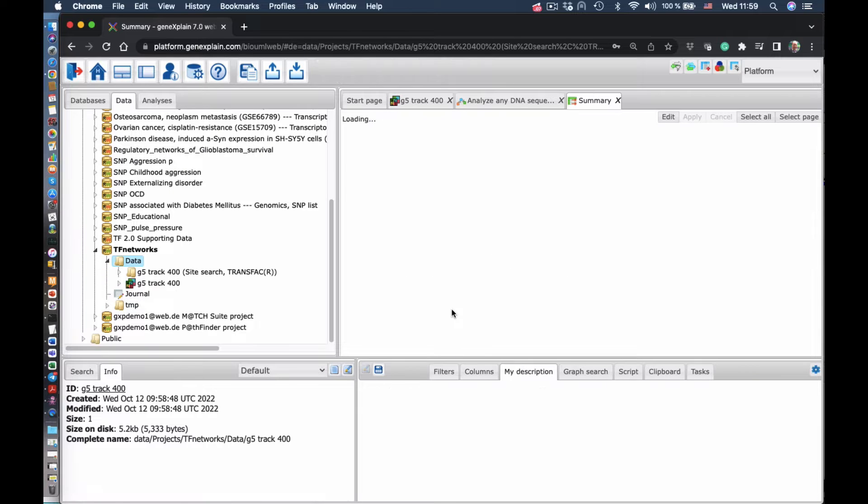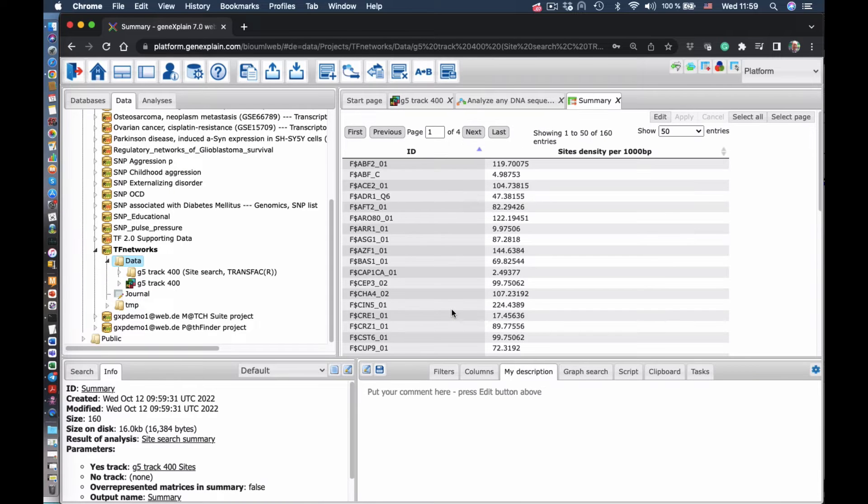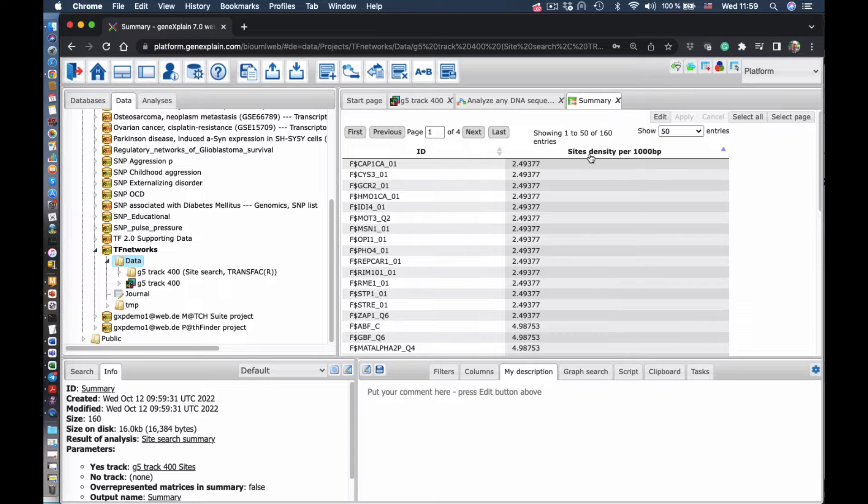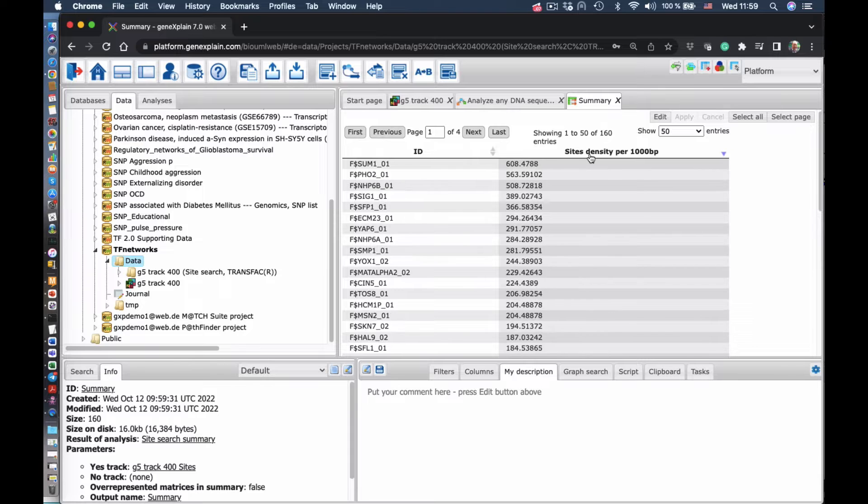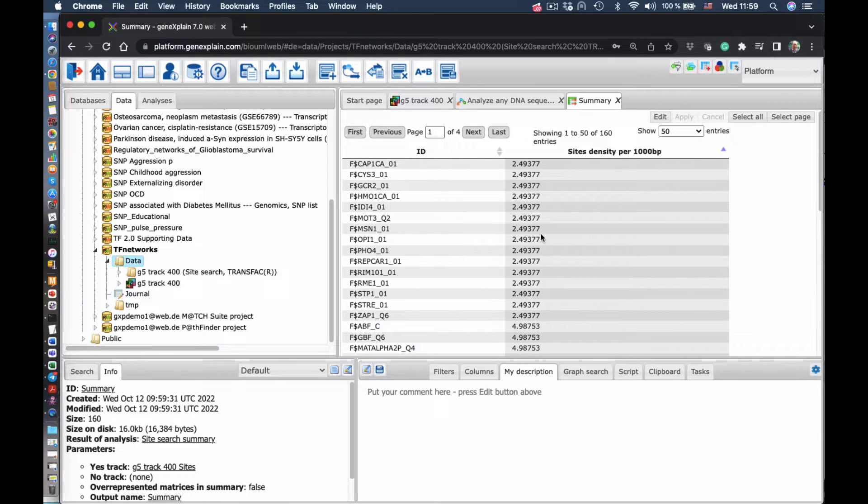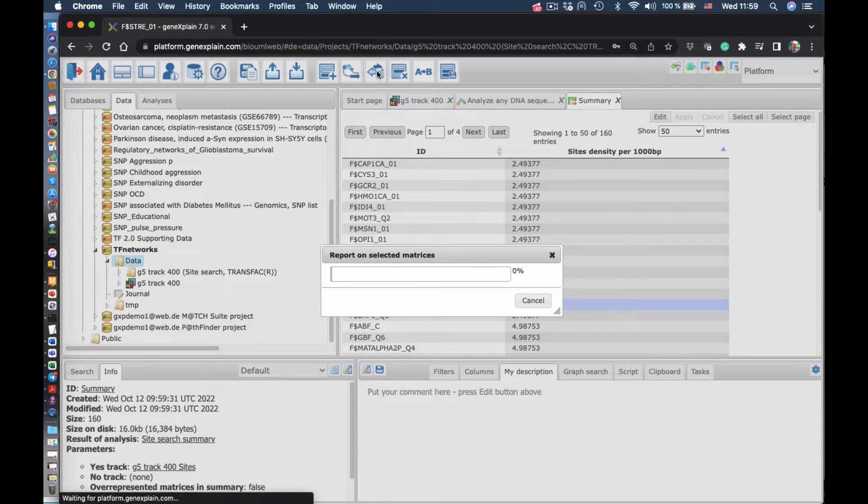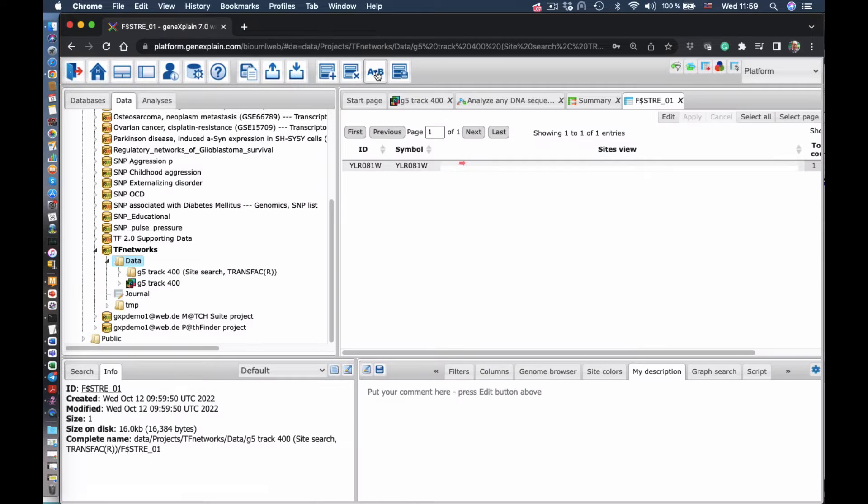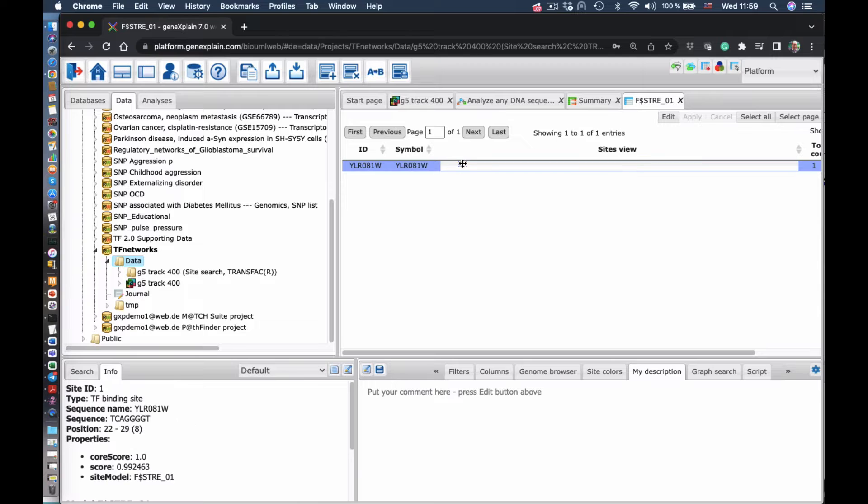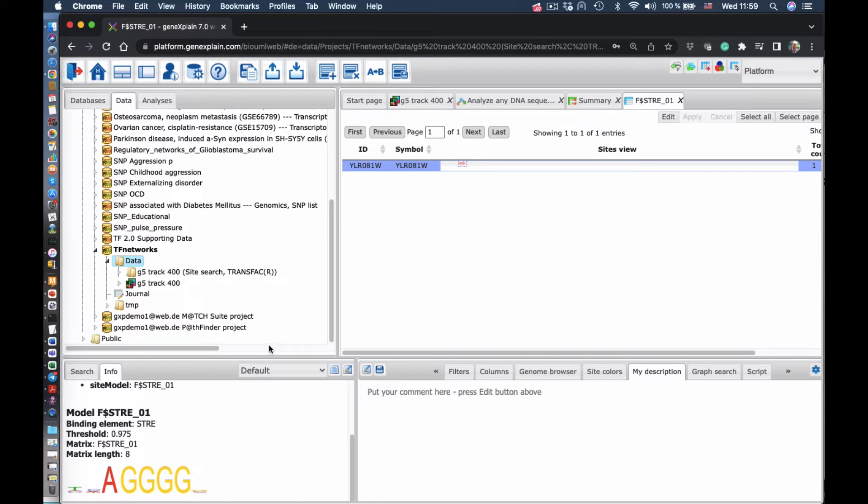As a result, we see this little table where we have our positional weight matrices listed according to the frequency of binding sites found in that promoter. So we can select one matrix and see where the site was found in that promoter.